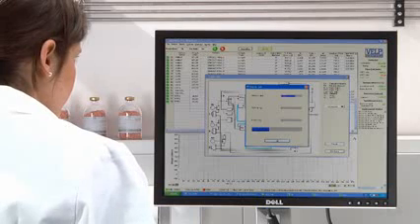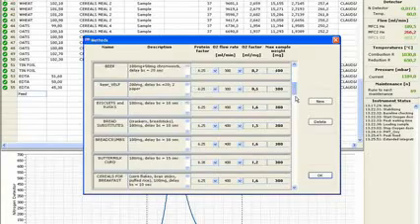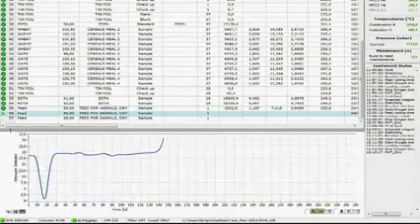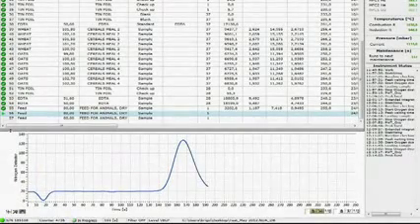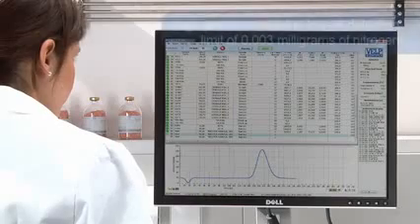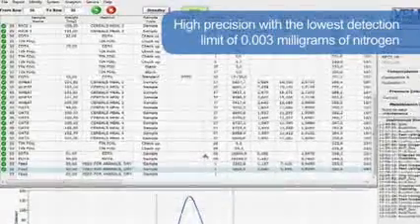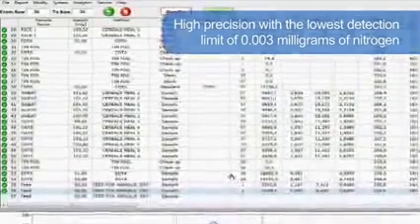The Dumasoft is quick and simple to use, with all the program parameters, run conditions and results displayed on a single screen of your PC, and is available in different languages. The real-time graph shows the progress of the analysis, creating a peak as soon as the nitrogen starts reaching the thermal conductivity detector. The NDA701 provides the highest precision of any such analyzer on the market, with the lowest detection limit of 0.003 mg of nitrogen.